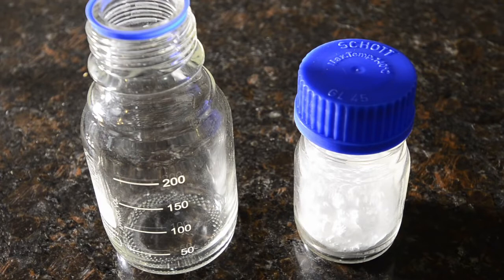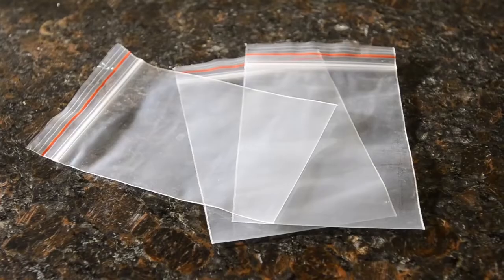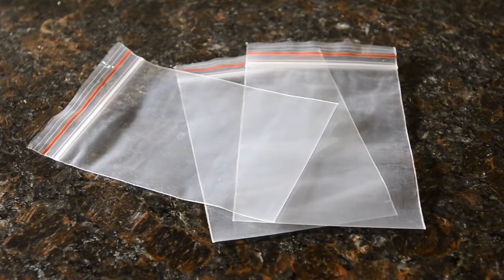We are lucky enough to have about 10 of these pro-quality 100 ml Durand storage containers and four of the 250 ml ones. But even these aren't good enough for some liquids — for example, ethyl iodide; they escape over a few months. The best tip we can offer is to pick up a load of these small sealable plastic jewel bags — they are great for storing small amounts of dry solids.